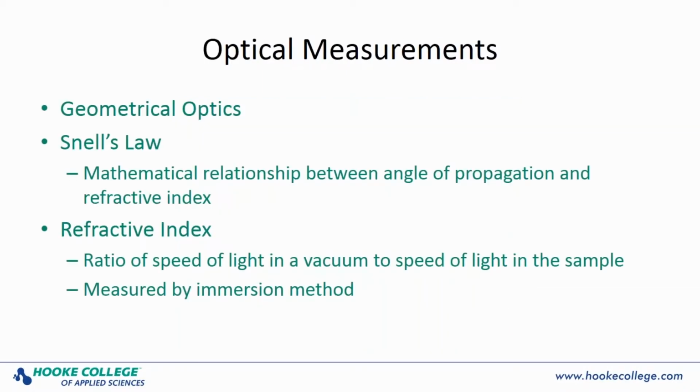For those particles that are not readily identified by morphology, optical data can be obtained. Measuring the refractive index, or indices as the case may be, of a substance is one of the most fundamental and useful optical properties available. When light passes from one medium, such as air, into a second medium, such as glass, the speed and angle of propagation changes.